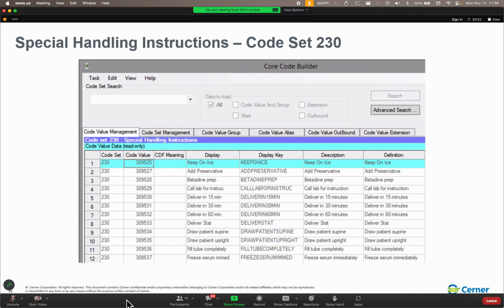Otherwise, it's going to throw off our test results. So if there is a time study order that immediately generates its accession number, then it will say, okay, hey, you routine order, you can join me. You AM draw order, you can join me. But if the time study order is on the collection list and routine says, hey, anybody want to go ahead and join me on my accession number, time study is going to go, nope, that would be way too early.